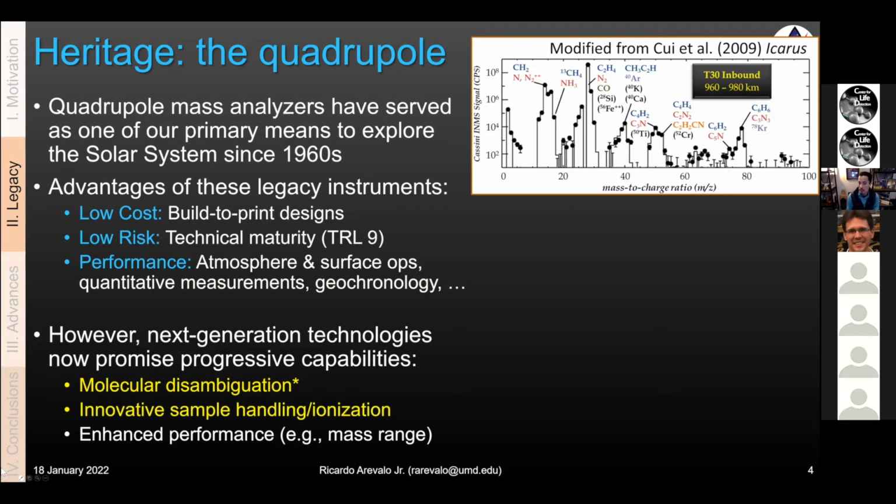But the peaks in this mass spectrum are fat. They're unit mass resolution. So we can't say with 100% confidence that this peak is entirely a hydrocarbon, or that this peak is entirely a noble gas. There's a variety of isobaric interferences that could be hidden underneath each one of these peaks. This isn't a new problem. So how do we build confidence in what we think we're seeing?